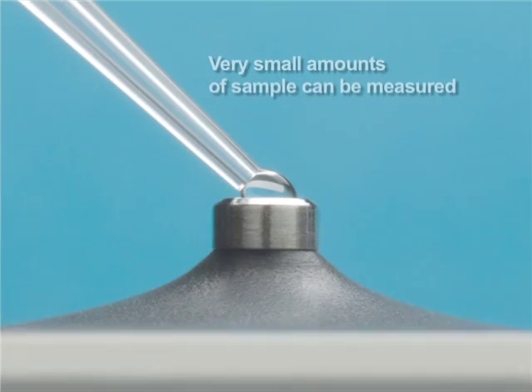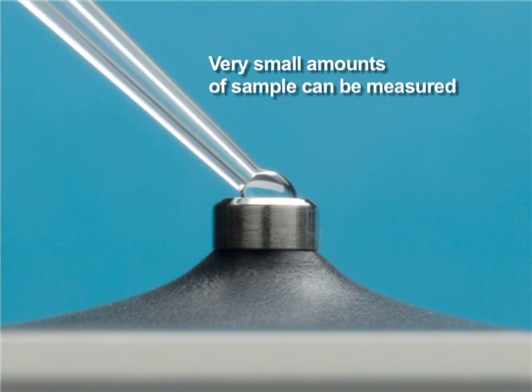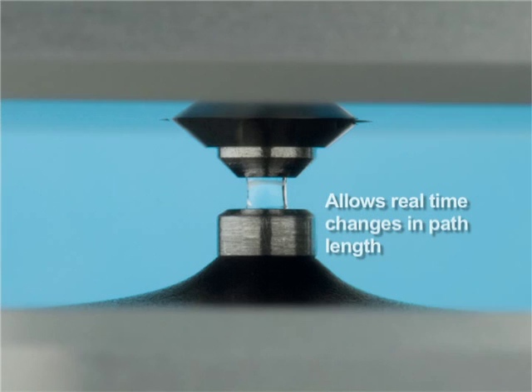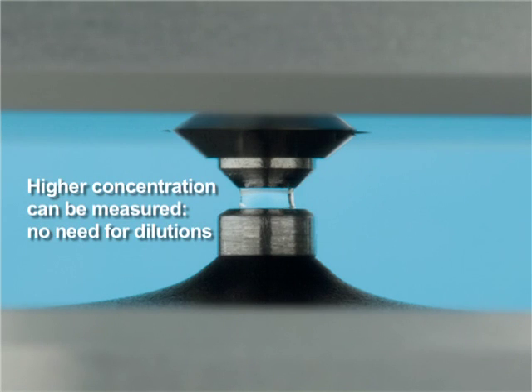Very small amounts of sample are needed for measurement — one to two microliters. Cleanup simply requires wiping the optical surfaces with a laboratory wipe, and the path length automatically changes in real time during the measurement. In addition, shortening the path length enables the measurement of higher concentrations, which effectively removes the need to perform dilutions for most protein samples.